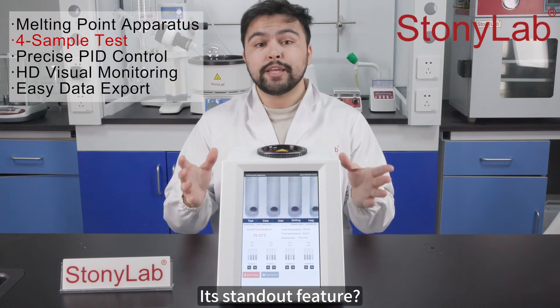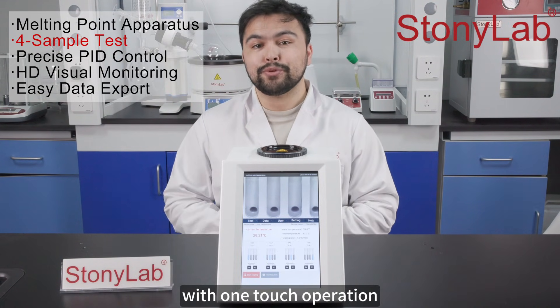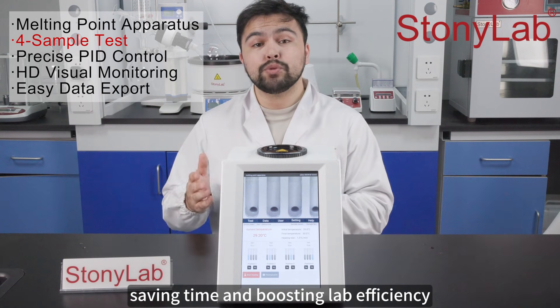A standout feature: you can process up to four samples at the same time with one-touch operation, saving time and boosting lab efficiency.